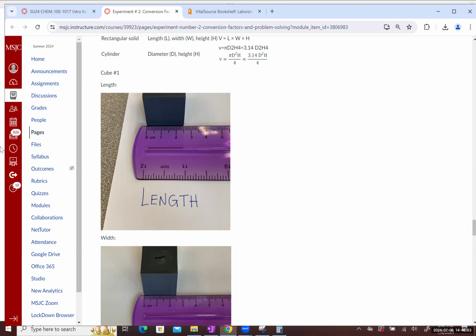So let's take a measurement now. So again, just quick sanity check here. We need to figure out the value of a tick mark. 1, 2, 3, 4, 5, 6, 7, 8, 9, 10. So to go 10 ticks takes us 1 centimeter. In 1 tick, that corresponds to 1/10 of a centimeter, or 0.1 centimeters. We know that 1/10 of a tick, which is what we can estimate up to, corresponds to 0.1 centimeter over 10, which is 0.01 centimeters.